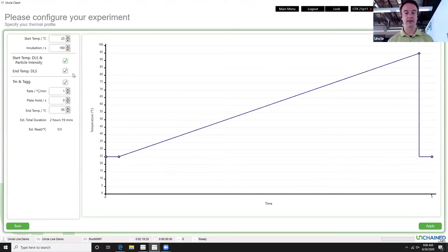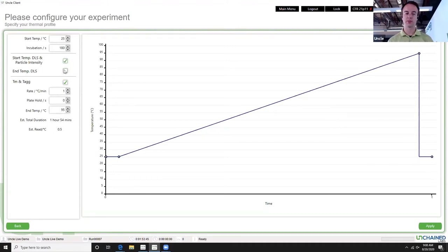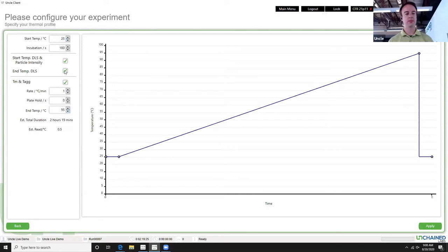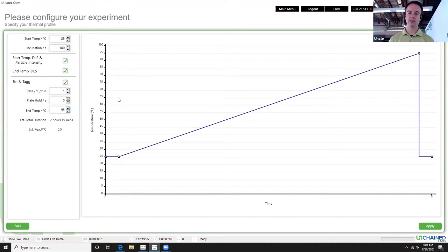Next comes the experimental design for the UNCLE. The capsid stability experiment works as follows: first, at the starting temperature of 25 degrees Celsius, we take an initial fluorescence read of the sample, followed by DLS — which we can select to include or skip. Then we'll run a thermal ramp between 25 degrees and 95 degrees Celsius to make sure that everything is unfolded and leaking all the fluorescence into solution. Following that thermal ramp, we'll take another end-temperature DLS read and then return to 25 degrees Celsius, where we'll do a final initial fluorescence read. In one experiment, we get more than five data points — looking at how the capsid was behaving before, during, and after the thermal ramp. We'll leave this as the default and hit apply.